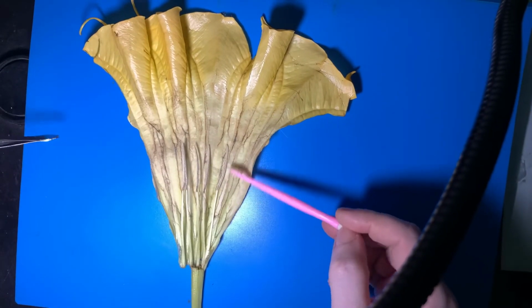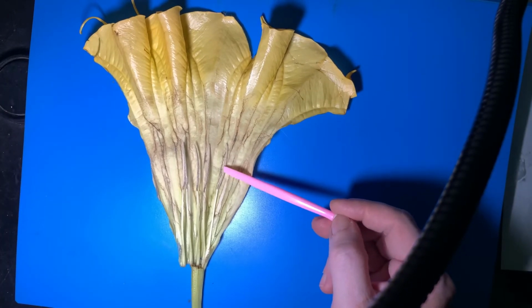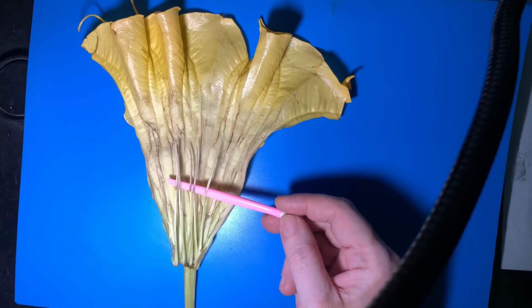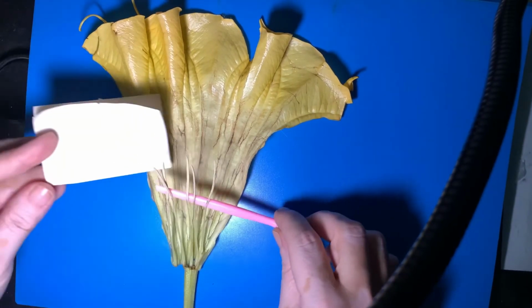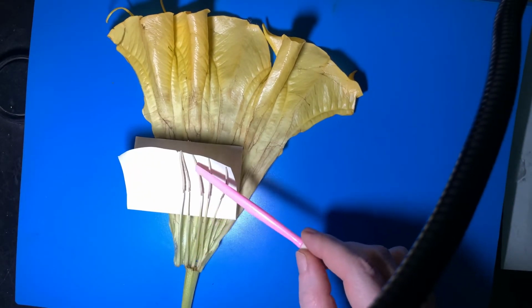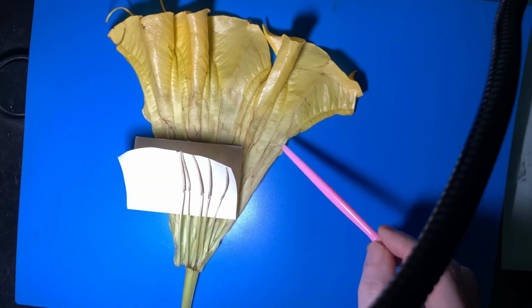And I have opened this flower, and you can see the male part. These are the male part of this flower. You can see very clearly. These are the anthers, the long anthers, and these are the filament. These two portions are the male part of this flower.